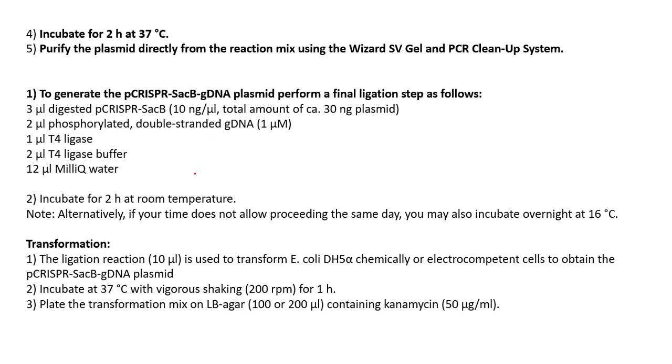Either you can proceed with the transformation, or you can incubate these overnight at 16 degrees centigrade. The next day you can perform the experiment.